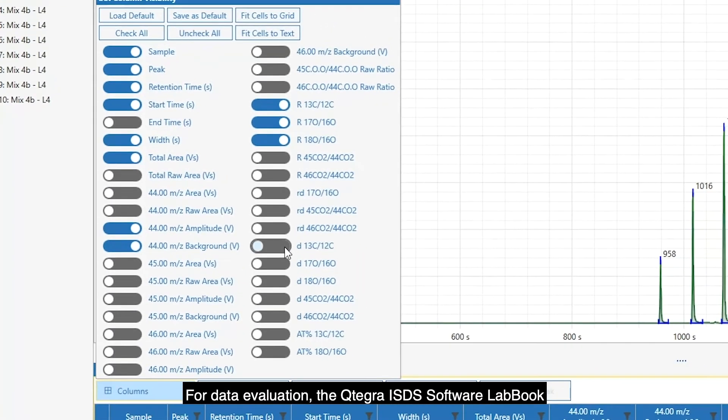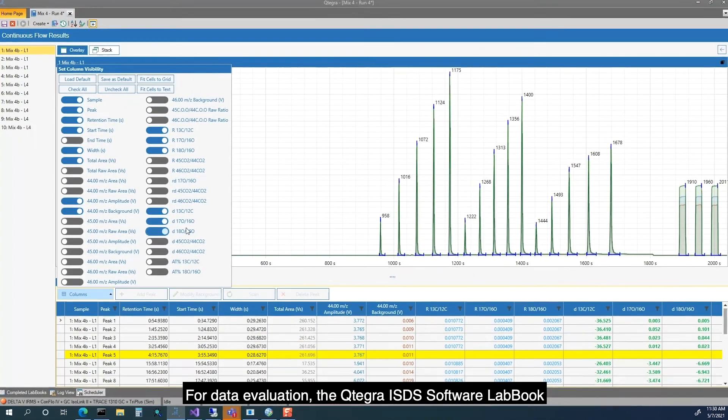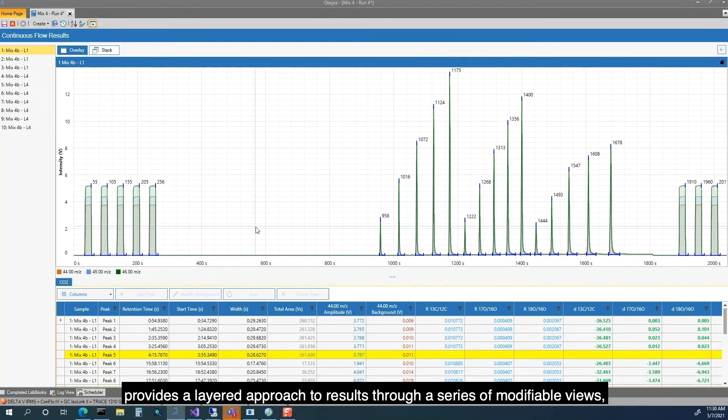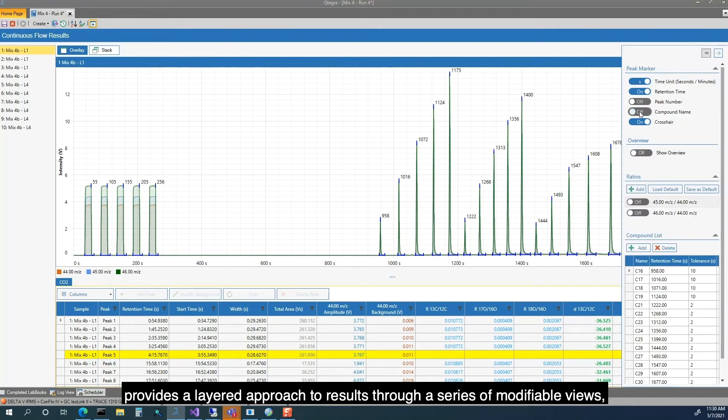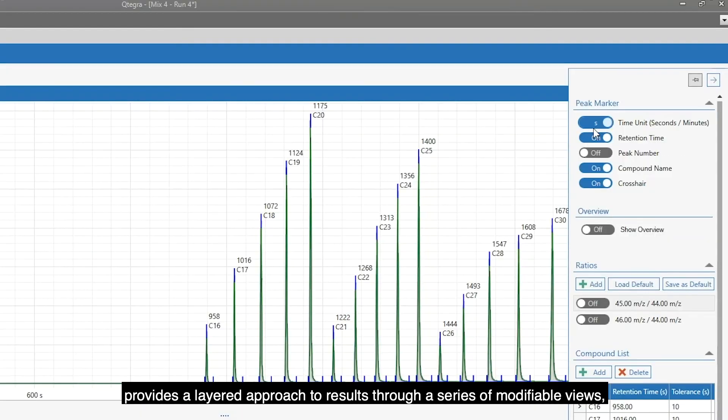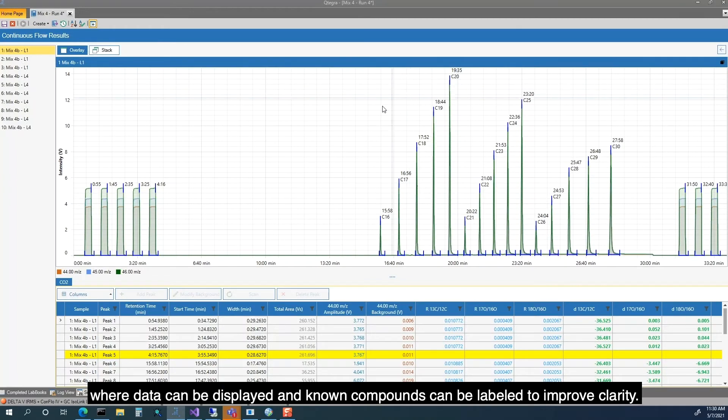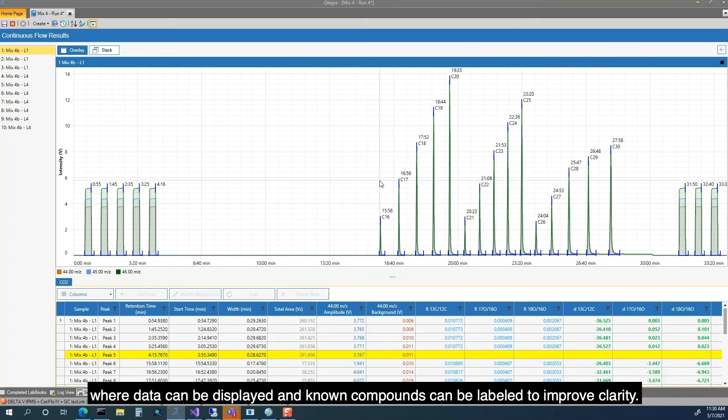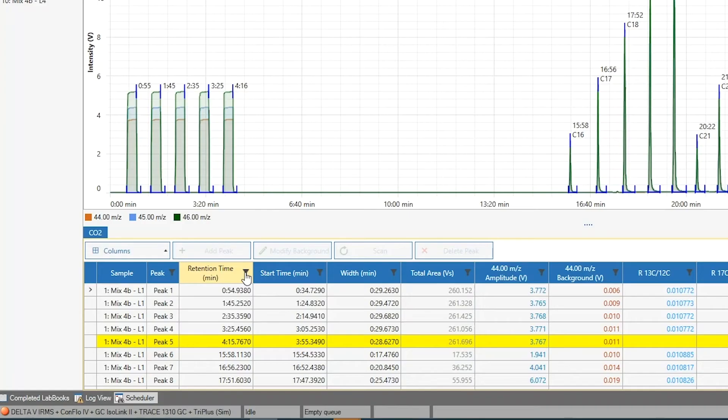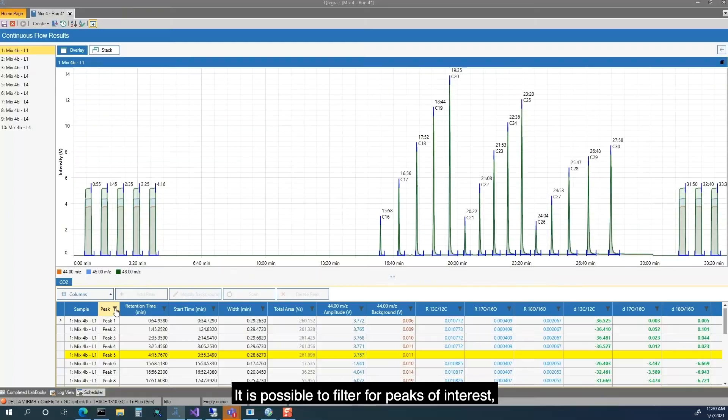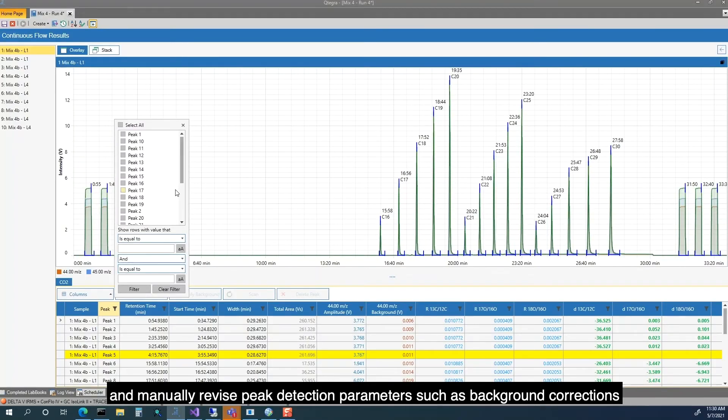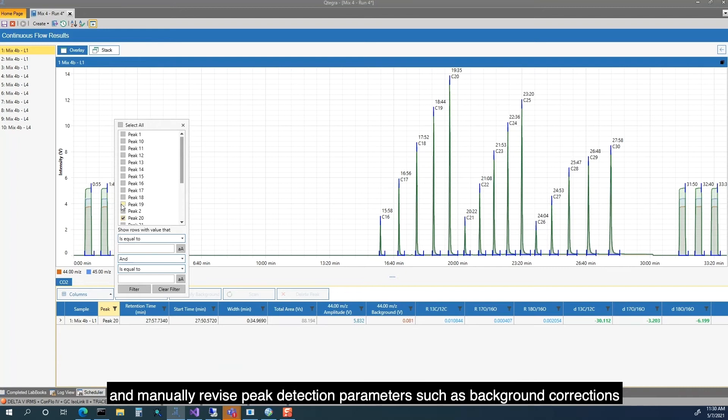For data evaluation, the Qtegra ISDS Software's LabBook provides a layered approach to results through a series of modifiable views, where data can be displayed and known compounds can be labeled to improve clarity. It is possible to filter for peaks of interest and manually revise peak detection parameters.